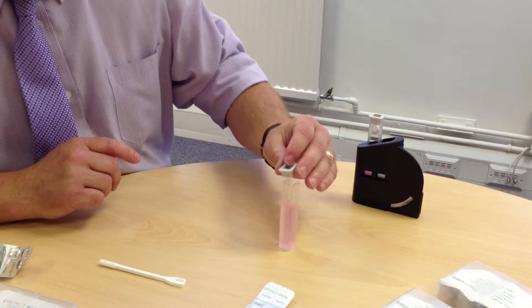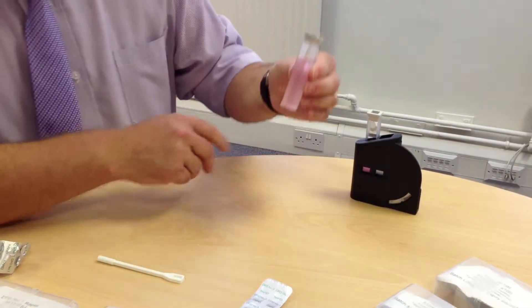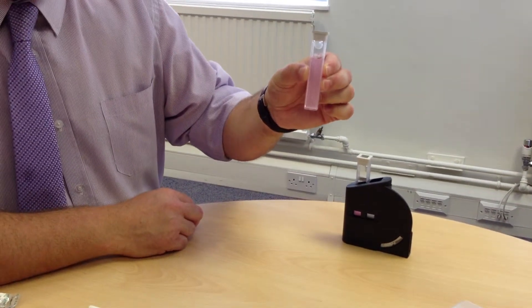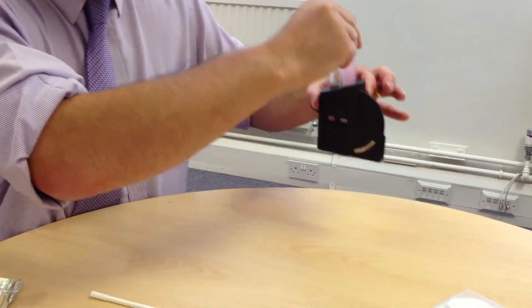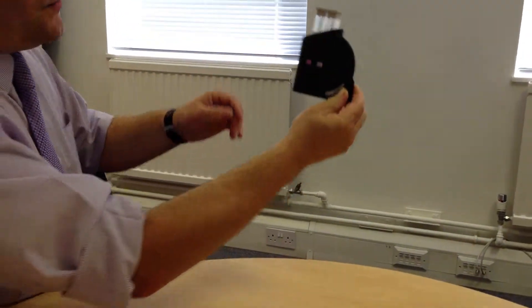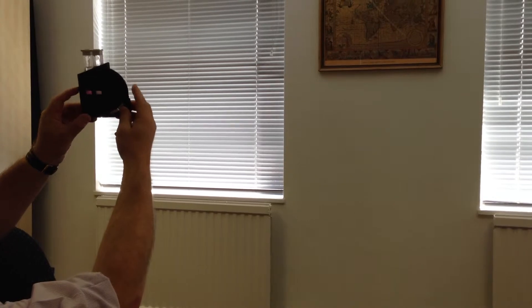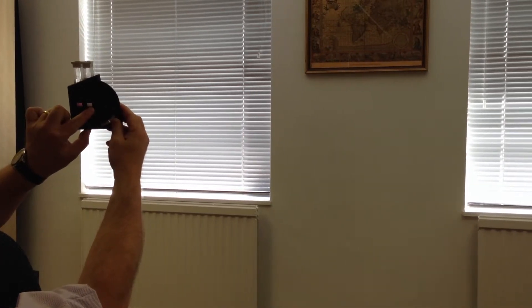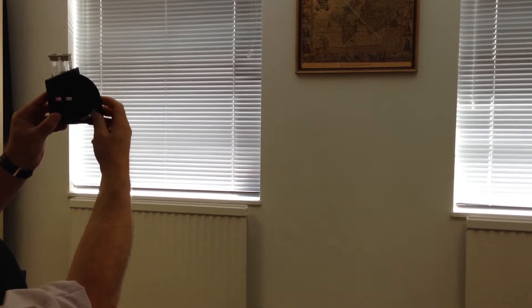As you can see, straight away there has been a reaction which has shown that chlorine is present, as the sample has turned pink. You would then put it into the other side of the comparator and using a natural light source you would then match the colour from the disc side to the test sample by turning the wheel.